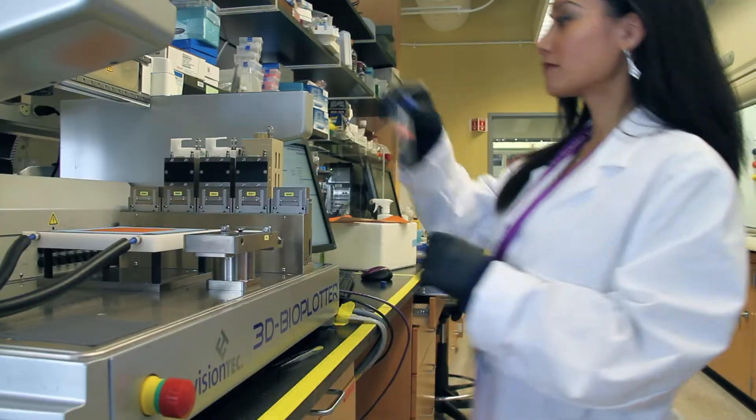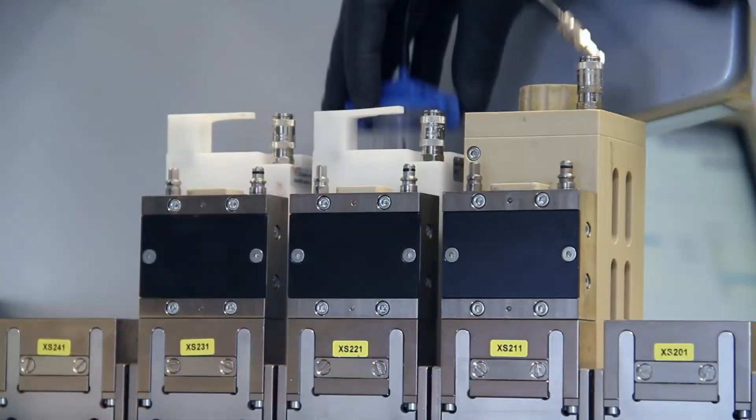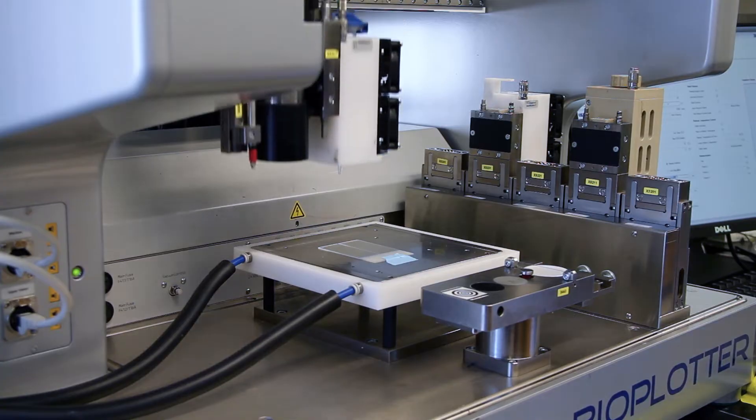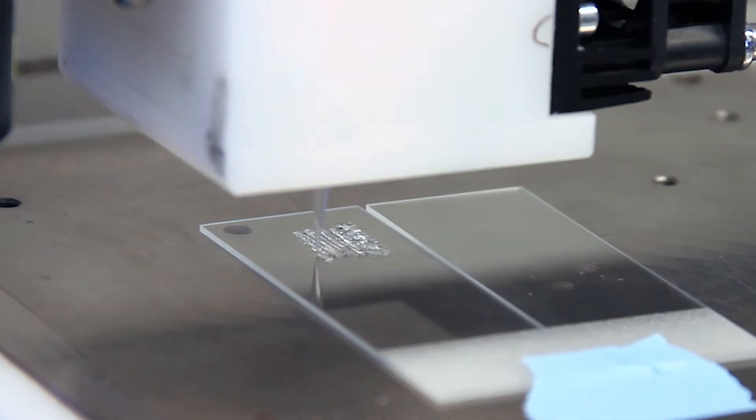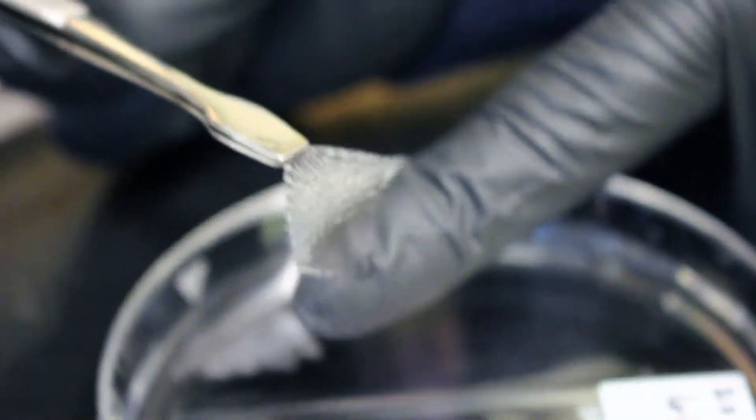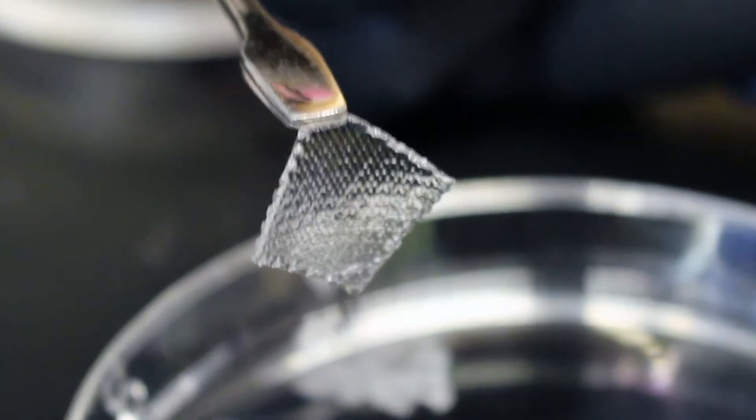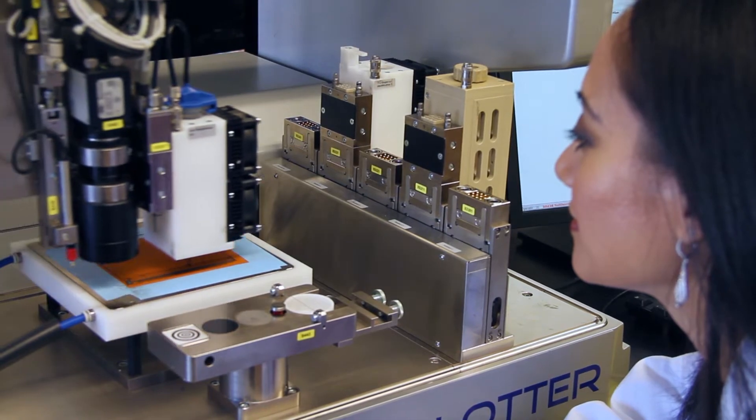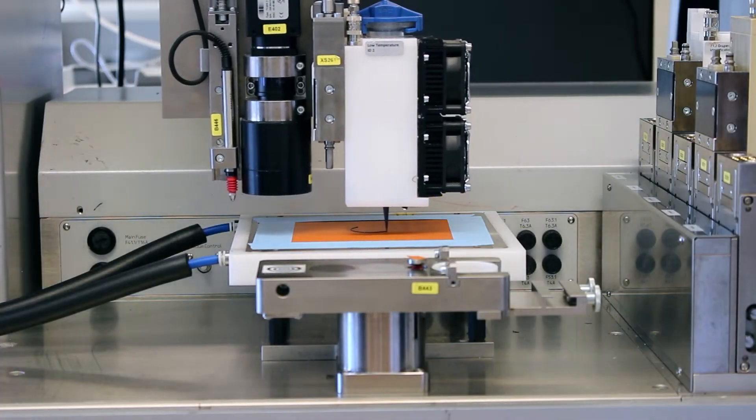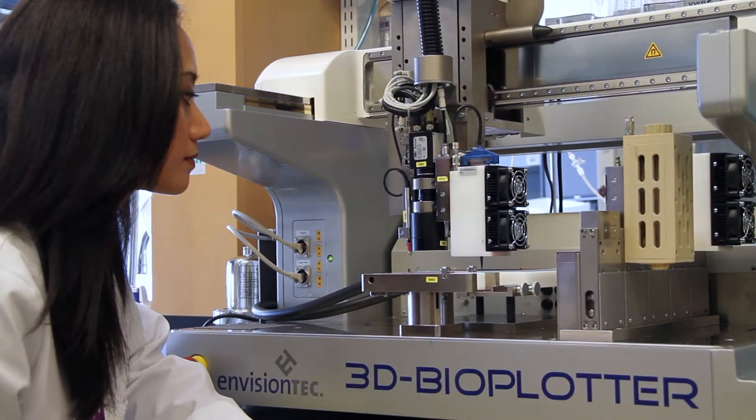My lab primarily focuses on developing new functional materials for 3D printing using a printing platform of direct writing. We have printable hydrogel systems to create complex organ and tissue systems, and we also have particle-based inks with the ability to print metals, ceramics, and biological tissues.